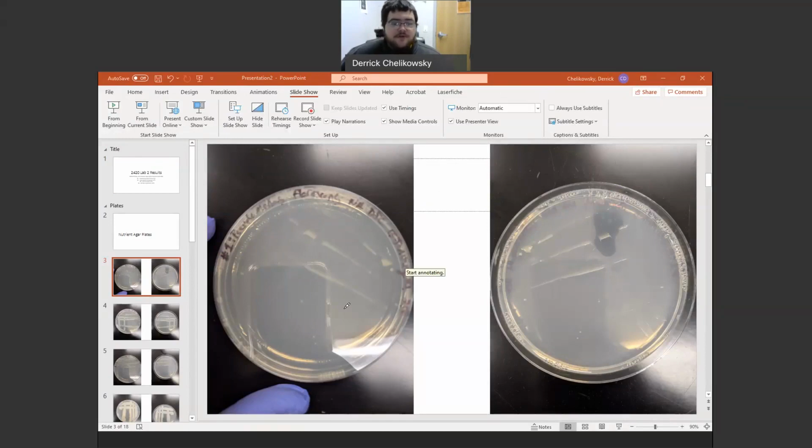Isolation streaks with Pseudomonas fluorescens are a bit difficult when we're only growing over 24 hours. Pseudomonas fluorescens, just based on what we grow them at, the temperature they grow at, and how long it takes, 24 to 48 hours, typically close to the 48 hours. So if you take a look at how I did an isolation streak, here's a streak, here's a streak, here's a streak. Notice how I'm using the upper section of the plate. Then we have another streak here, here. I did not go back for bacteria.